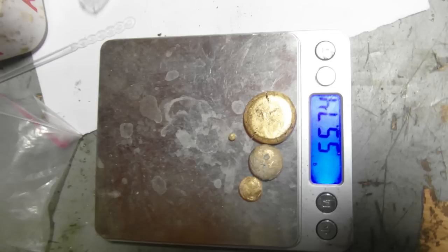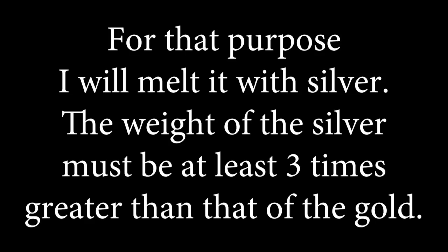Hi, as promised in the previous video, in this one I will refine the remaining 55 grams of gold. For that purpose I will melt it with silver. The weight of the silver must be at least three times greater than that of the gold.